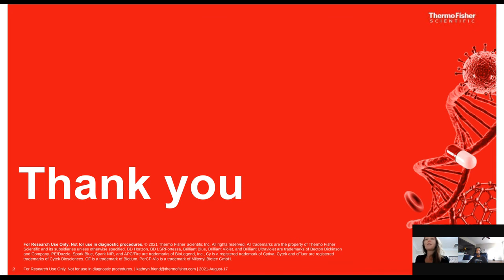So watch this space. Yes, the answer to that question really is yes, NovaFluors can be used for intracellular, and we are coming up with an optimized protocol shortly. Absolutely. The NovaFluor itself is about the size of an antibody, and the antibody fluor conjugate is still smaller than PE. So it can absolutely be used for intracellular. The blocking is a little bit different from a standard intracellular protocol, and we don't have that released yet. But if you have questions about that, you can definitely shoot me an email.